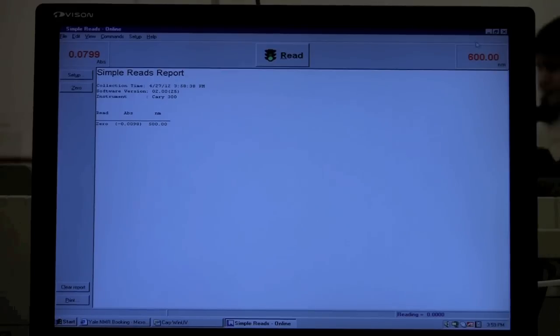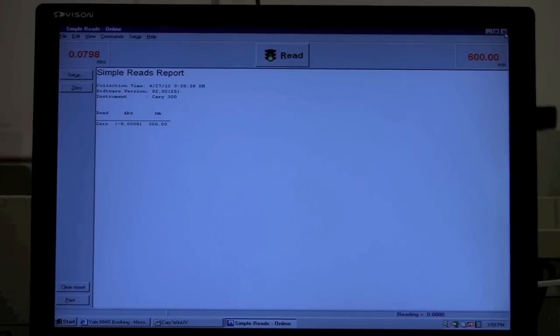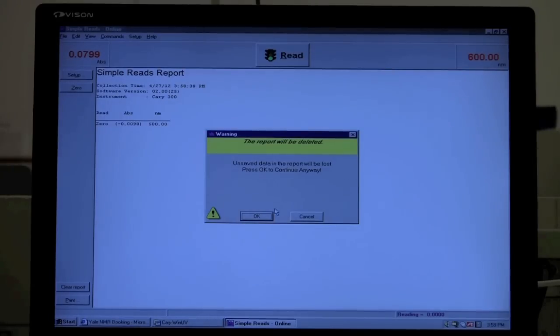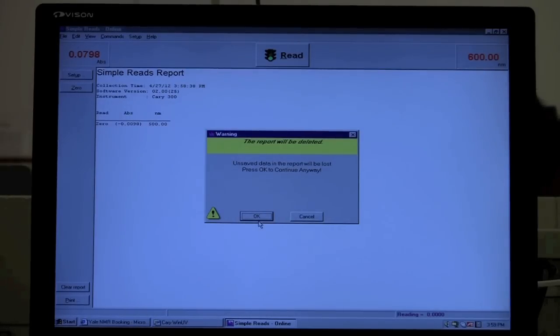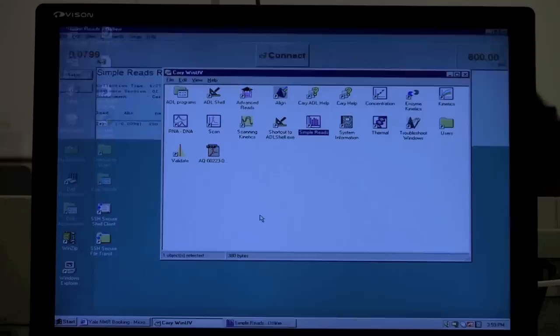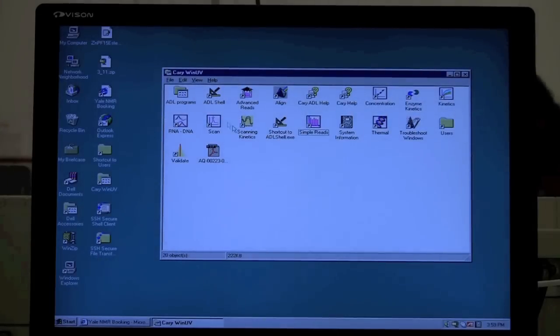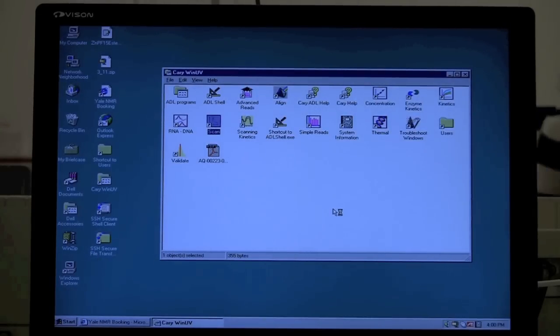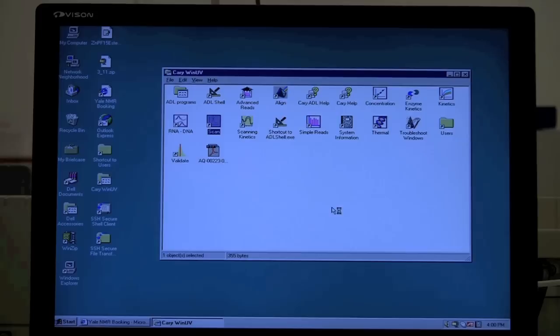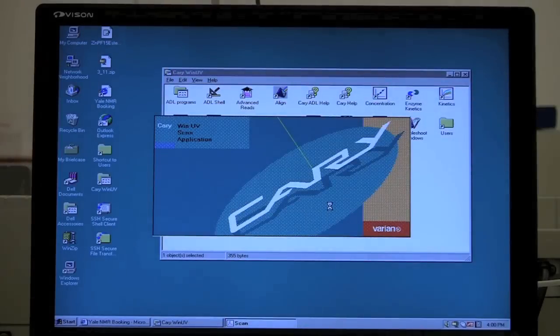Now another mode that you may want to use is the Scan mode. If you wanted to, you should save your data. We'll go over that in a later time. Scan mode is a scan program here. This is for collecting a spectrum at a variety of wavelengths.